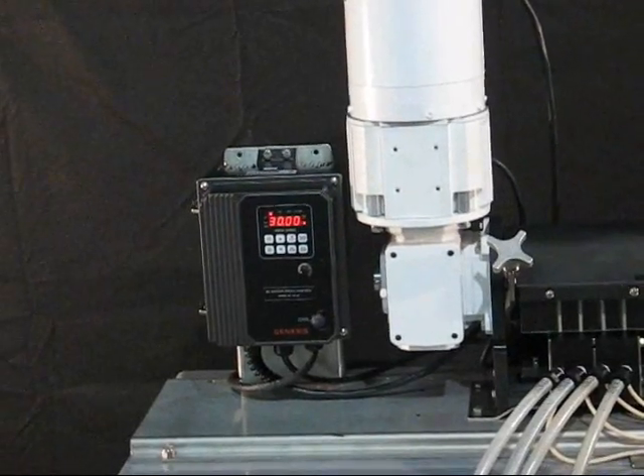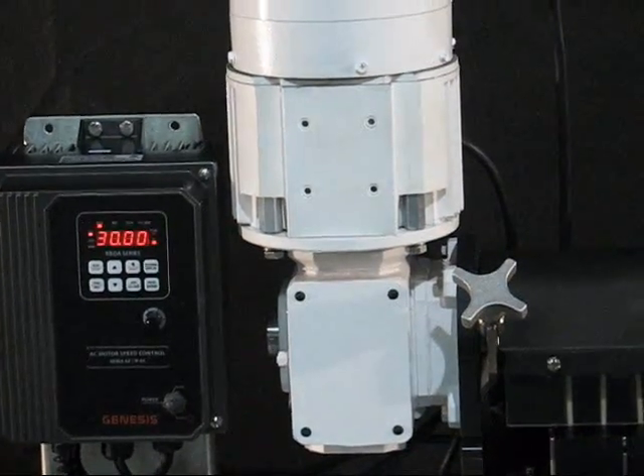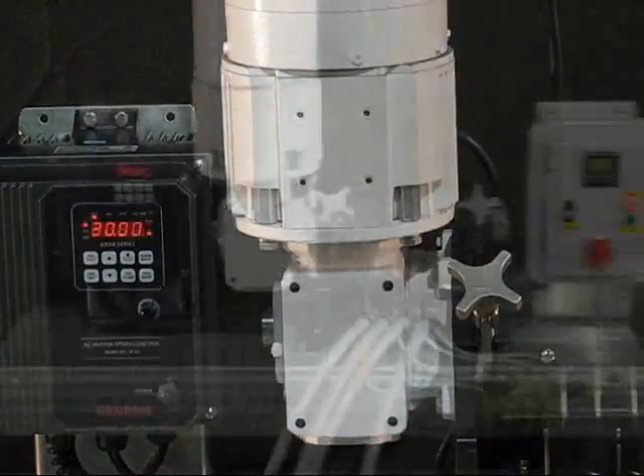One of the features of the dosing system is that the motor runs constantly. We use this clutch brake for precise starting and stopping.